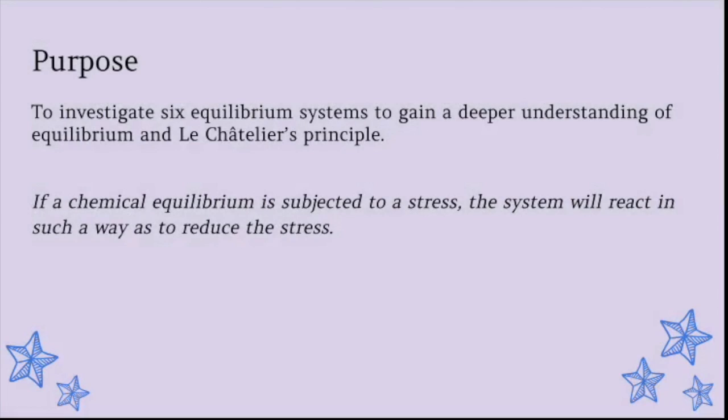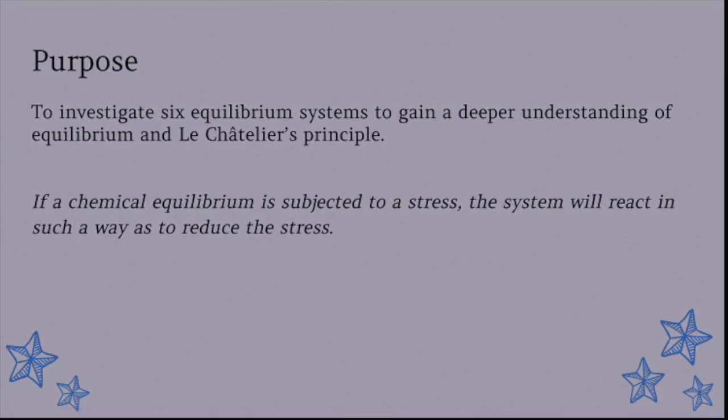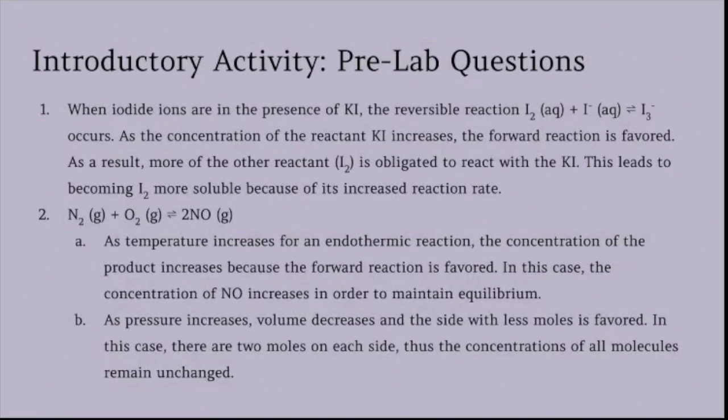Our purpose is to investigate 6 equilibrium systems to gain a deeper understanding of equilibrium and Le Châtelier's principle. If an equilibrium is subjected to a stress, the system will react in such a way as to reduce the stress. According to Le Châtelier's principle, the increase of the concentration of a reactant will favor the forward reaction.